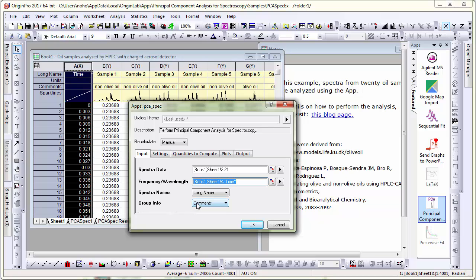I have already set it to comments which is where the information is available to distinguish one sample from another in terms of which group they belong to.